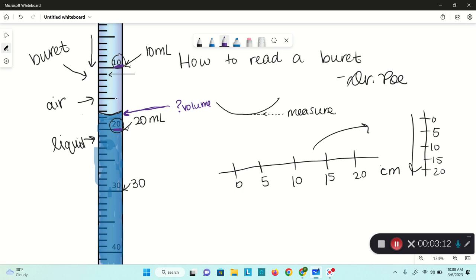Immediately between 10 and 20, we see this big mark, and it's safe to say that's 15. If we look, we see one, two, three, four dashes between 10 and 15, so each one of those is probably going to be one milliliter. So this is 11 milliliters, then 12 milliliters, 13, 14, and 15, and it all adds up.